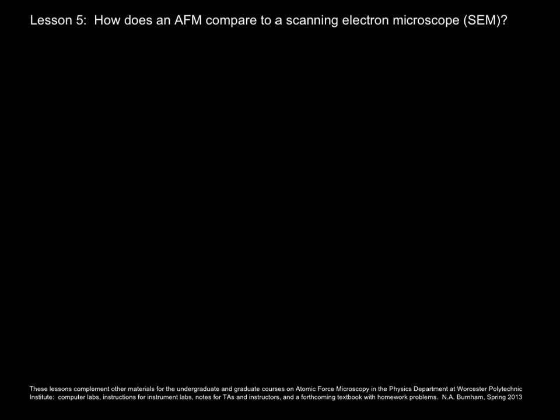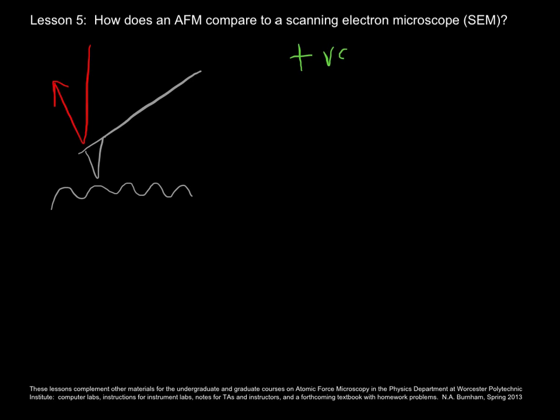So here, I just put up a little visual reminder of an AFM with the cantilever, the laser beam near a sample surface. And let's say, okay, well, what's good about AFM? Well, first of all, you don't have to have a vacuum. Yes, you can do AFM in vacuum, but you can also work in air and also in liquids. All right, biologists really like that because you can study living cells.